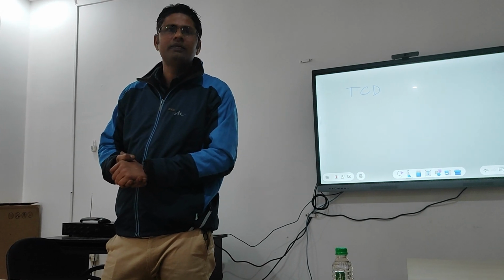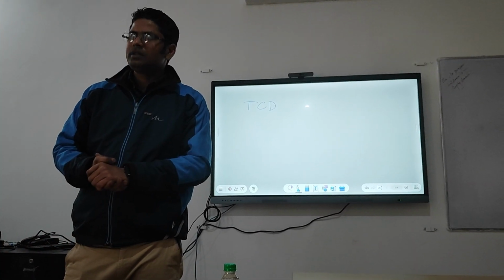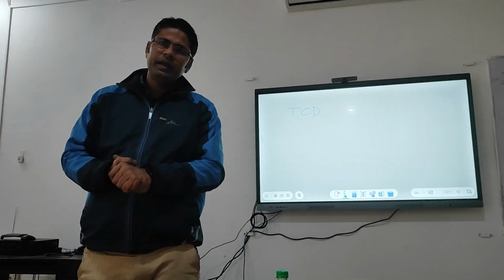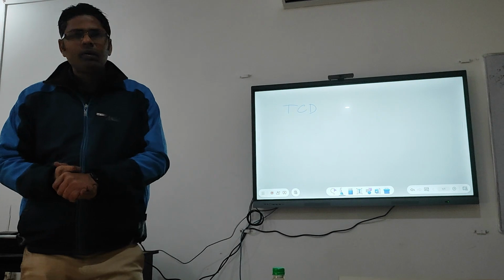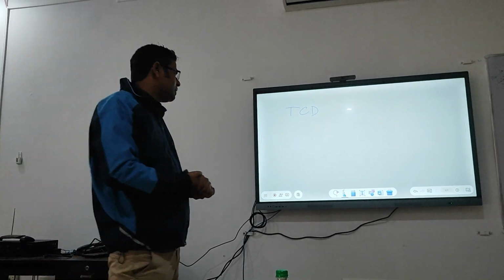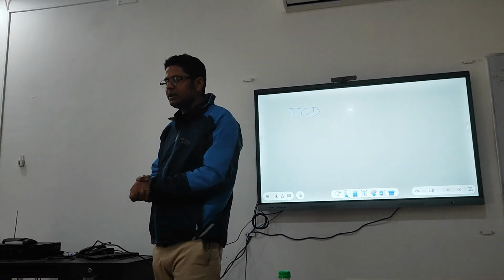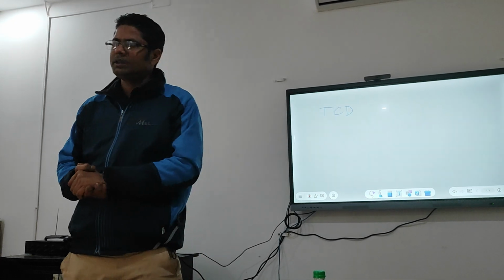So which component is responsible for this? As I told, it can detect anything. Before going to the detector details, we need to know how it works. There is a Wheatstone bridge: two filaments are inside the detector and two filaments are in its electronic parts.